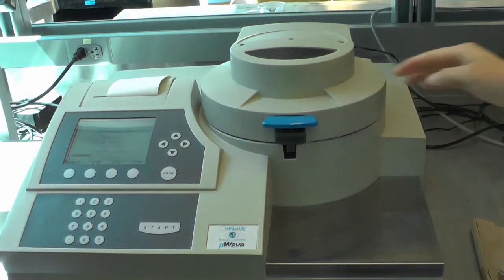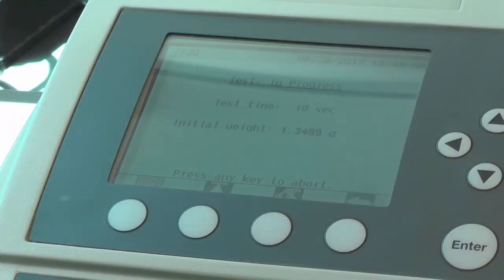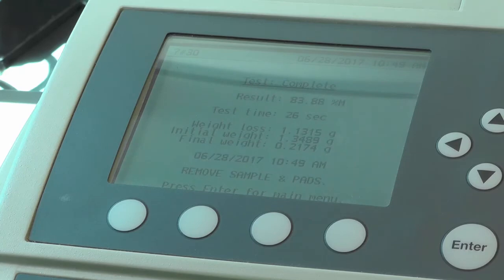Close the cover of the chamber tightly to initiate the test. The test screen will say 'In Progress.' When the test is complete, it will automatically stop and results will be displayed on the screen. You will also be prompted to either return to the main menu or run another analysis.